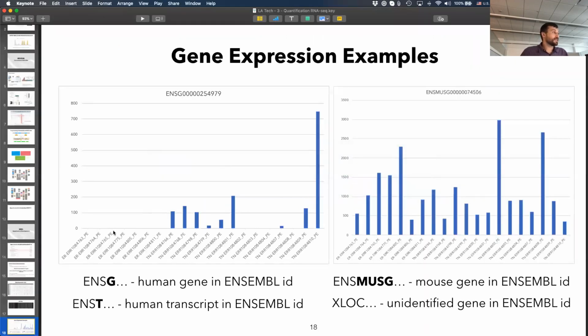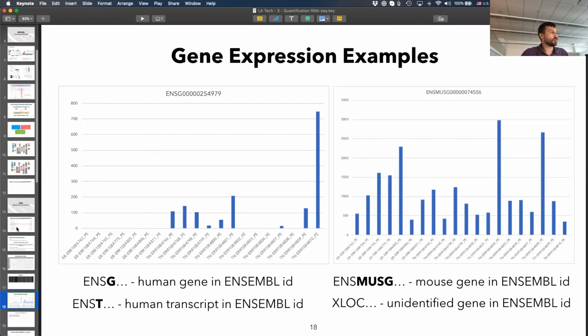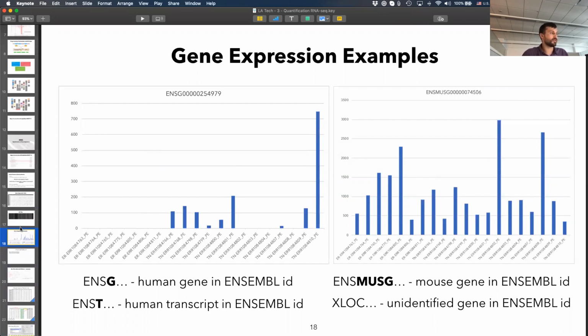Now, the next thing that we want to do is start understanding this hypothesis-free tool for RNA-Seq, and understand how to use different methods of analysis to compare different conditions, understand what's in our data, and then set up a comparison. So that's what we wanted to cover today.